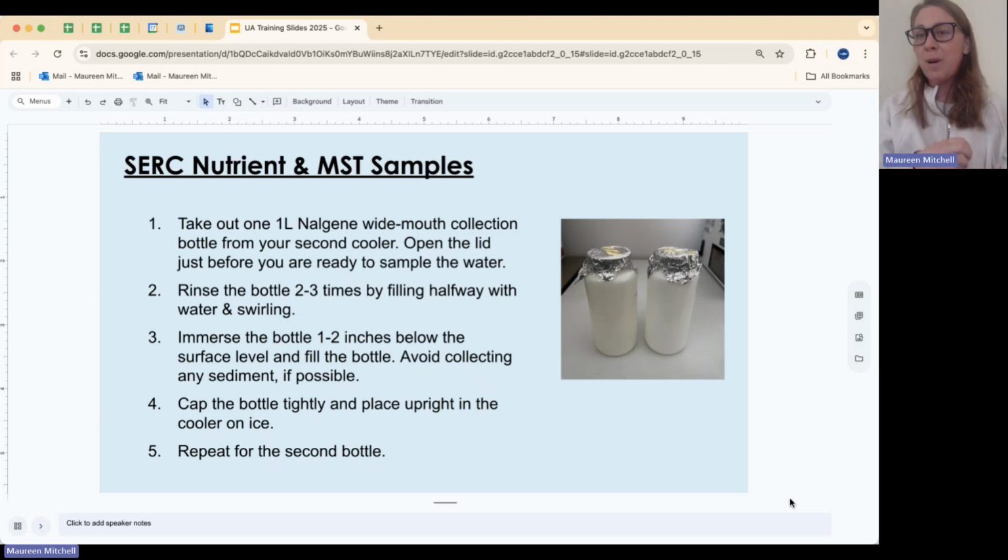You'll treat these just like those small turbidity bottles. You'll scoop, rinse 3 times. Taking that 4th bottle, you don't need to scoop the entire bottle full when you're rinsing, just halfway full, give it a nice shake. But that 4th time, please do your best to fill it as full as you can. If you're in a nice deep stream, invert it, allow it to fill. Try not to get scum from the top or dirt from the bottom. In a narrow stream, you can do the darn best you can, and some substrate and some surface scum's going to get in because it's a shallow stream. Once you get it, secure it, try to store them upright so substrate drips to the bottom and doesn't continue to be suspended in the water, and put it in your cooler close, but not as critically close to the ice pack as you can.